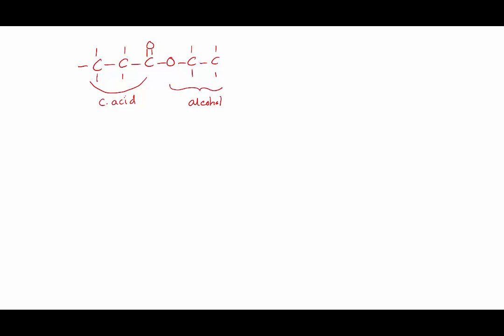And there's two key chemical shift regions that we look for to assign the groups at the beginning of each one of these parts. The hydrogen attached to the carbon attached to the oxygen is going to be between 4 and 5 parts per million. So we want to look for that group because that will be the group that was attached to the alcohol and now is attached to the alcohol part of the ester.